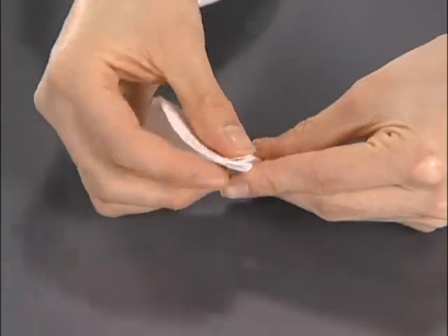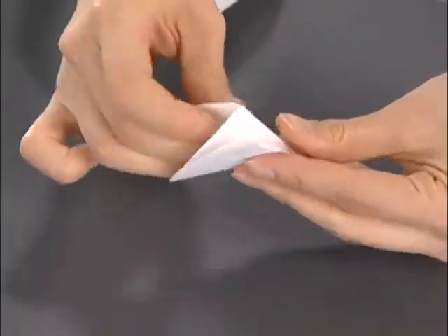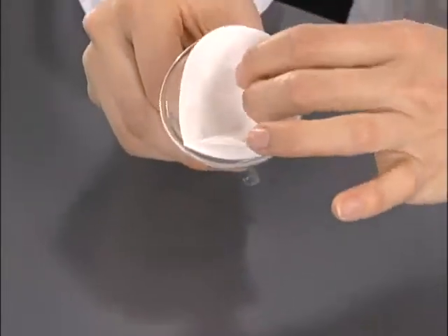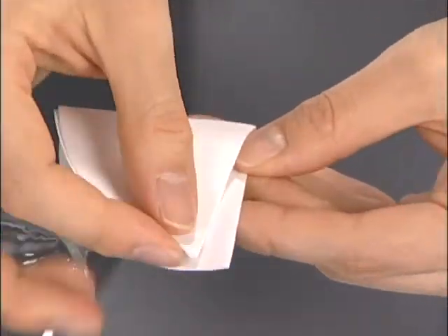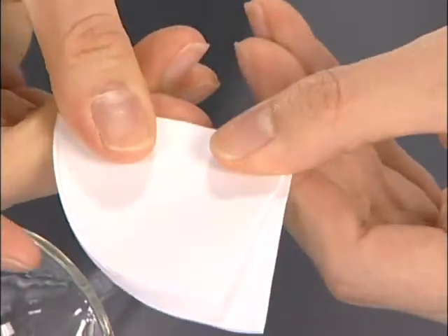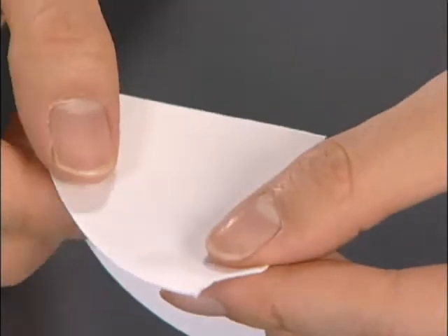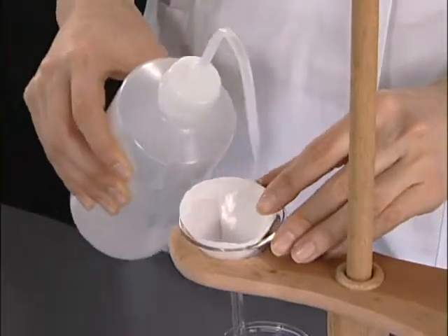Fold the filter paper into fourths and fit it into the funnel. When the filter paper does not fit well, offset the fold line slightly. In order to make the filter paper fit perfectly, cut obliquely the edge of the overlapping filter paper. Wet the paper with the solvent and press to fit the paper in.